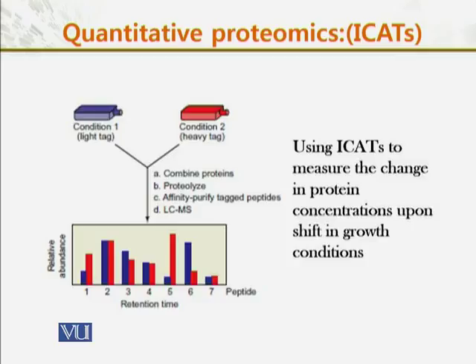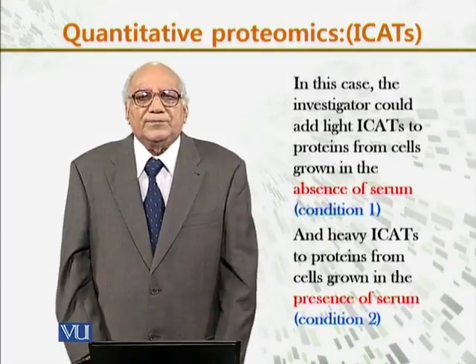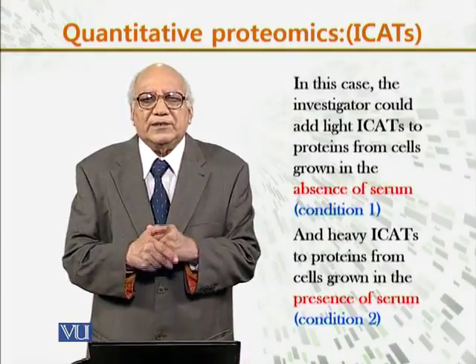You can see the retention time, which tells us about the peptide, and on the y-axis, how much of it is present, that is, its concentration.